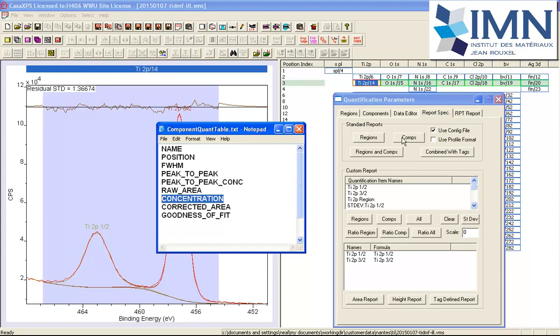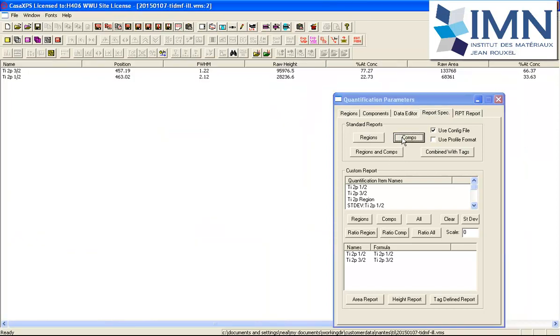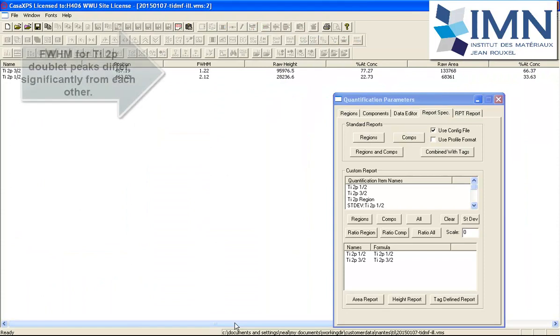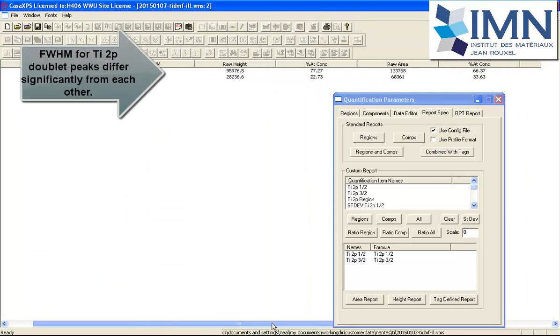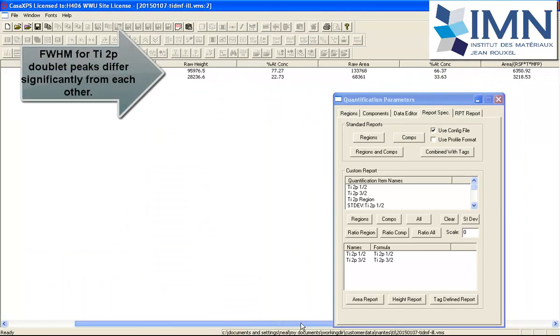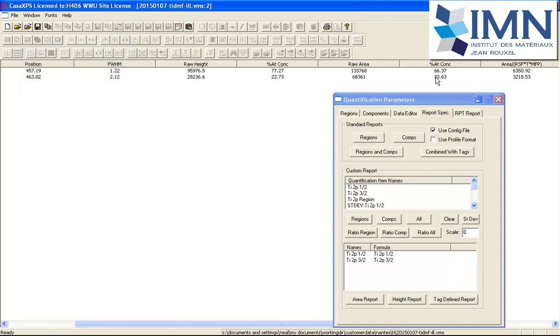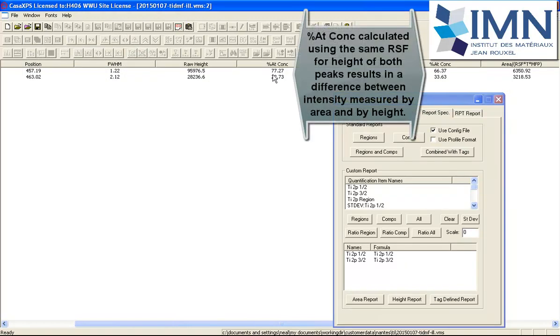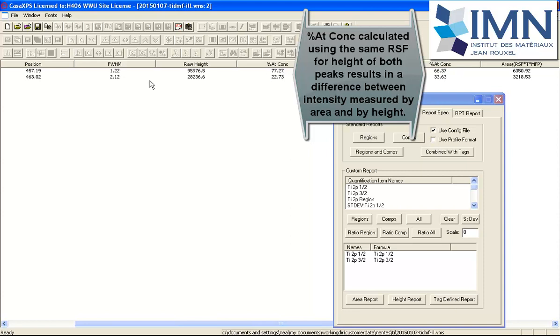When I press the components, we'll see corresponding information to what we saw with the gallium 2p. Here we have the raw area—this is, as you'd expect, very close to 2 to 1 for this 2p doublet. However, when you look at the height, you can see that the concentration calculated using the same relative sensitivity factors is very different. That's because the full width half maximum for each of these component peaks is very different.